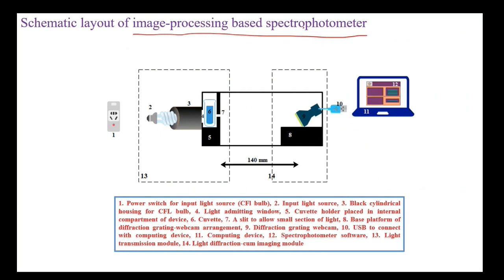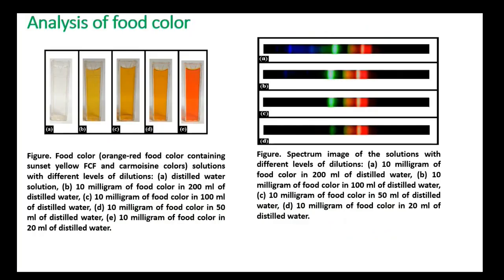We saw what an image processing based spectrophotometer looks like, and how its construction is different from that of the conventional spectrophotometers. Then we discussed how we can analyze the data from it. We also discussed that colored solutions act as filters, and accordingly, from the color wheel chart, the complement pairs of colors show how they can alter the spectrum of a given color solution.